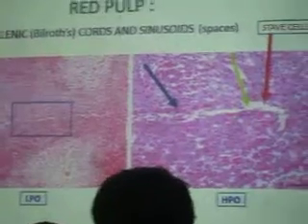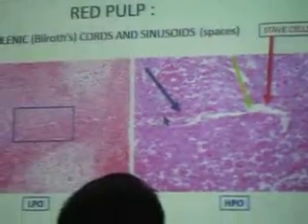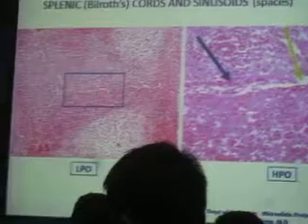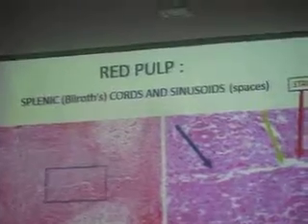If you have here stave cells, they are at the side, rod-like, elongated. So in between stave cells will insinuate the T lymphocytes for their recirculation. That is where mature lymphocytes pass going back to the circulation.